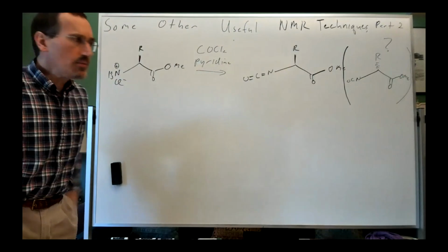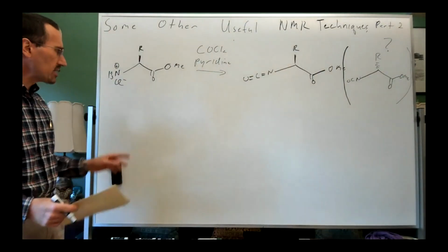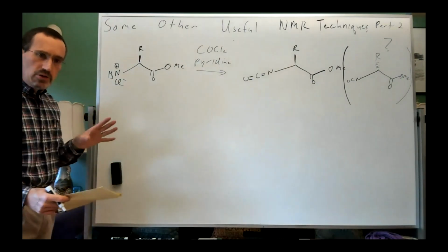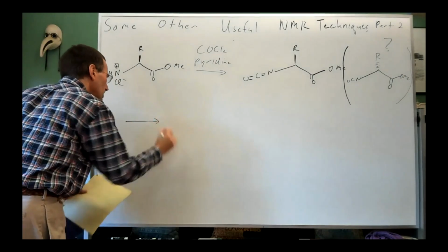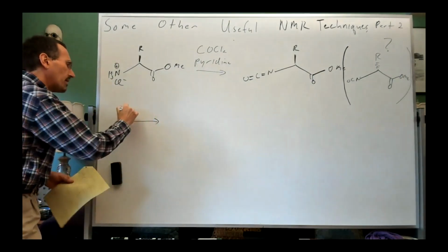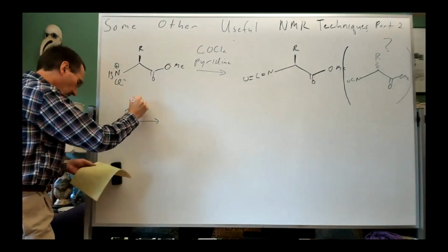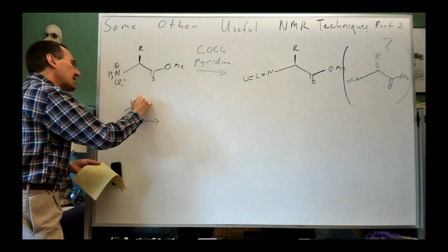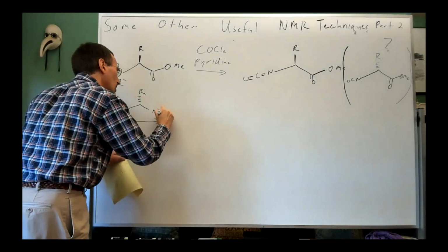So as I said, we couldn't tell enantiomers apart by NMR spectroscopy, but we could tell diastereomers apart. So in order to analyze what was happening, we took our phenethylamine, so basically the amine or the enantiomer of the amine isocyanate I just showed.